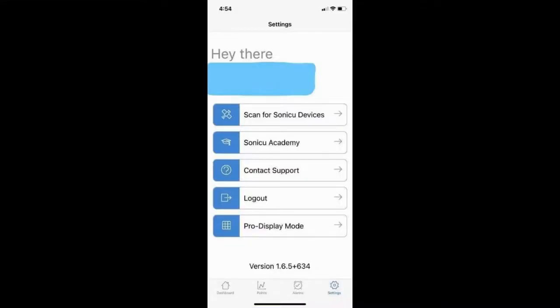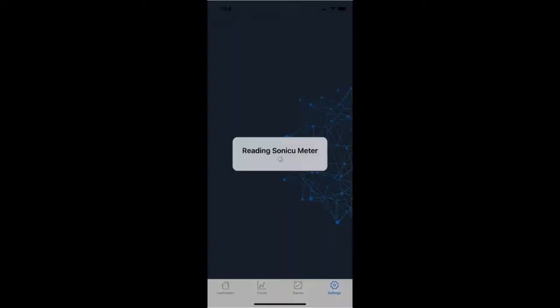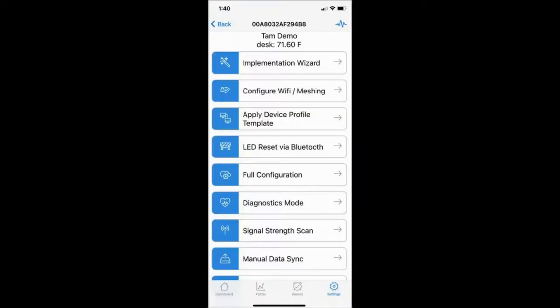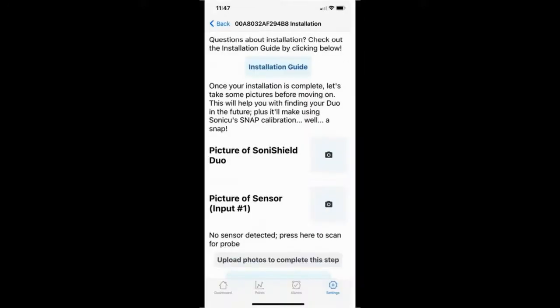Select the device that is powered on and in proximity. The Sonic Cloud mobile app will read the configuration of the Duo. Select the implementation wizard, click Get Started, and take your pictures — this provides Sonic U the ability to perform quality checks for partners and customers. The next step is connectivity, which should automatically connect.